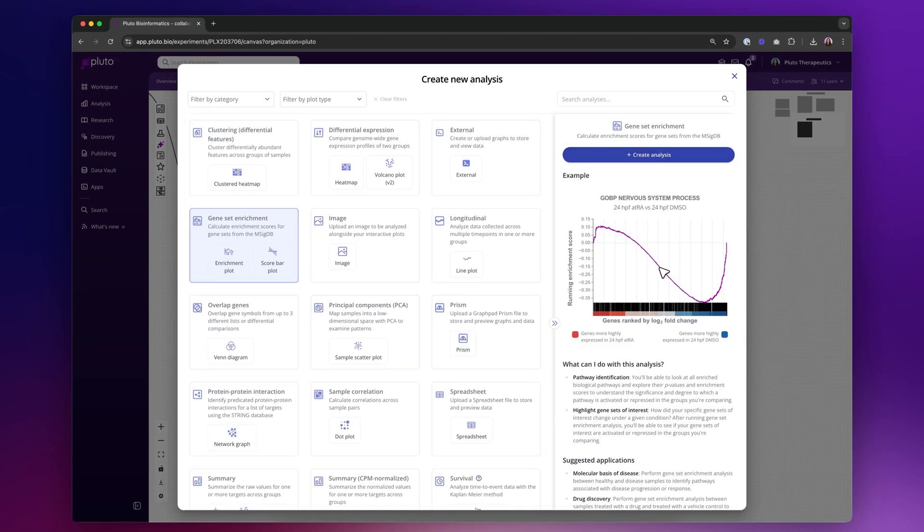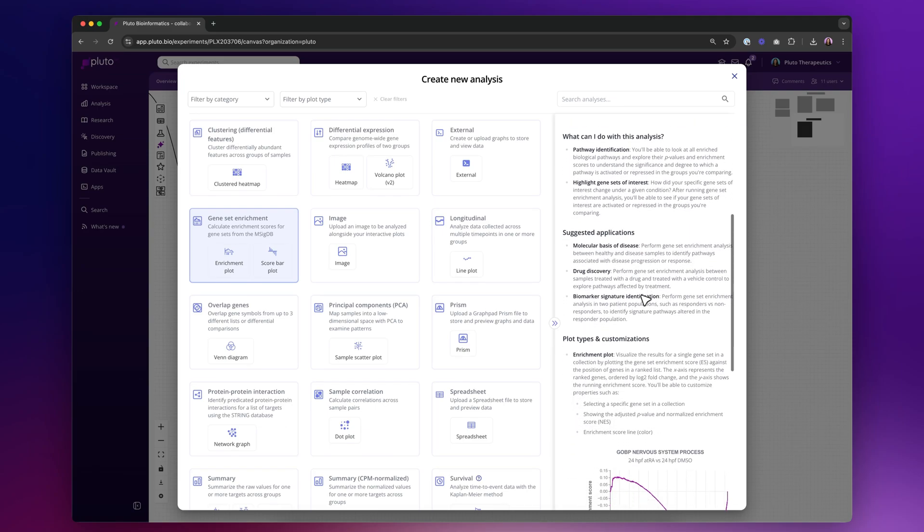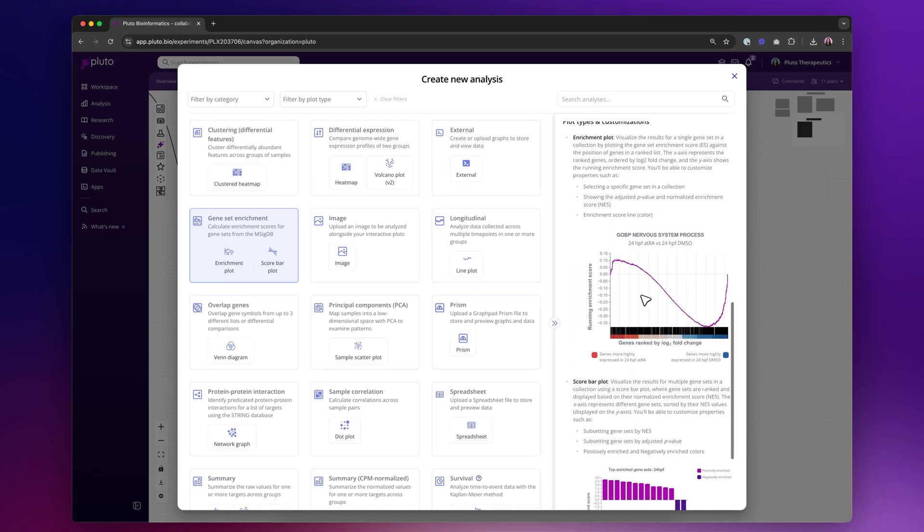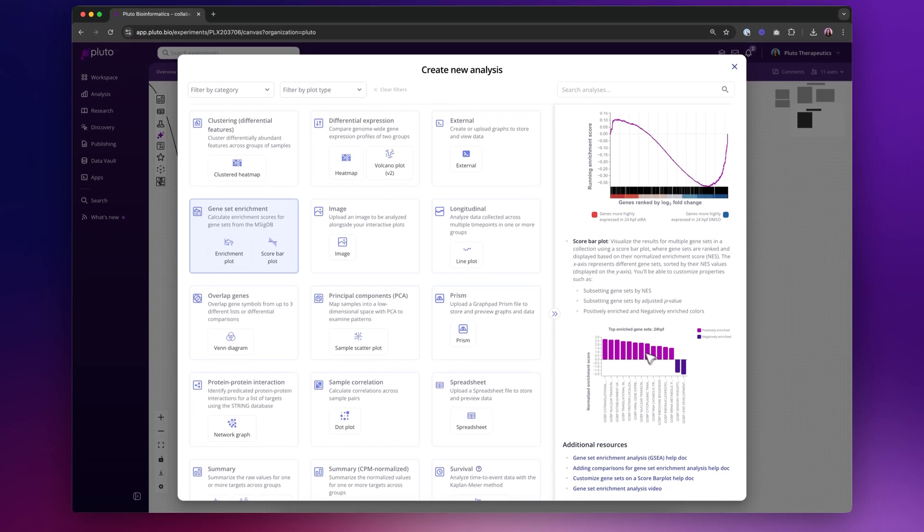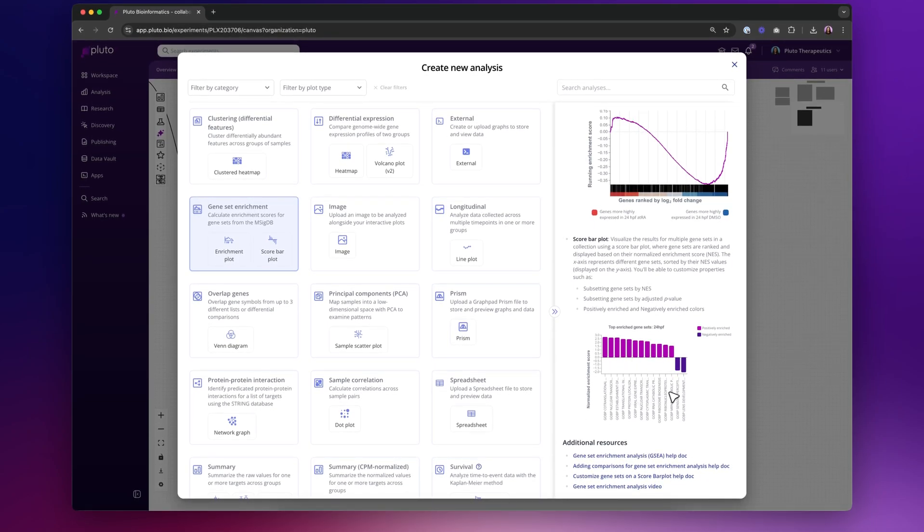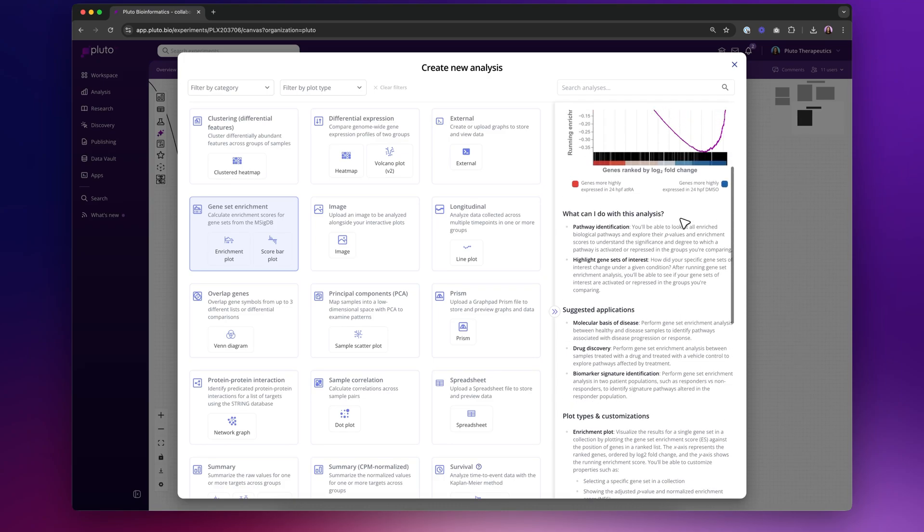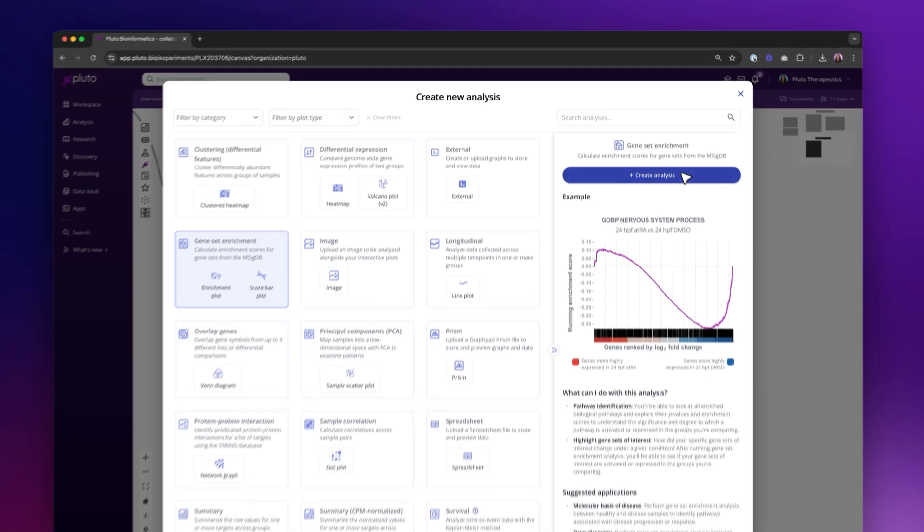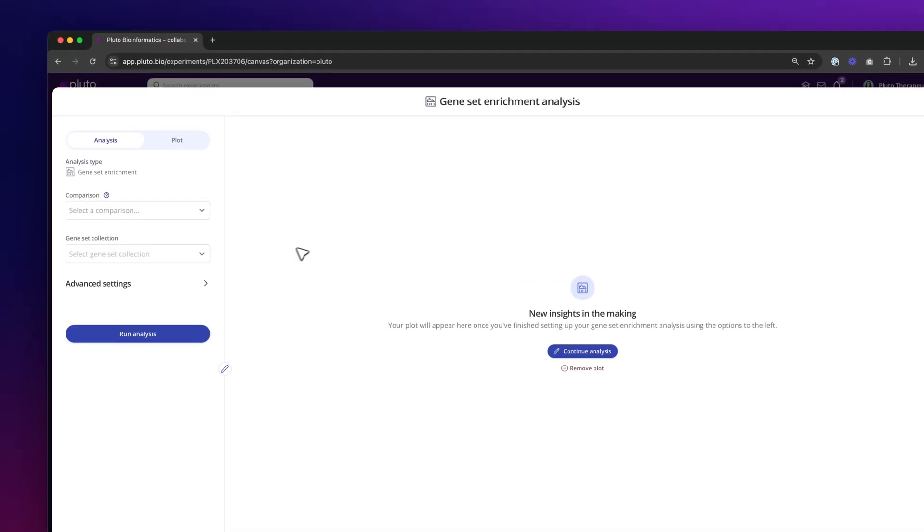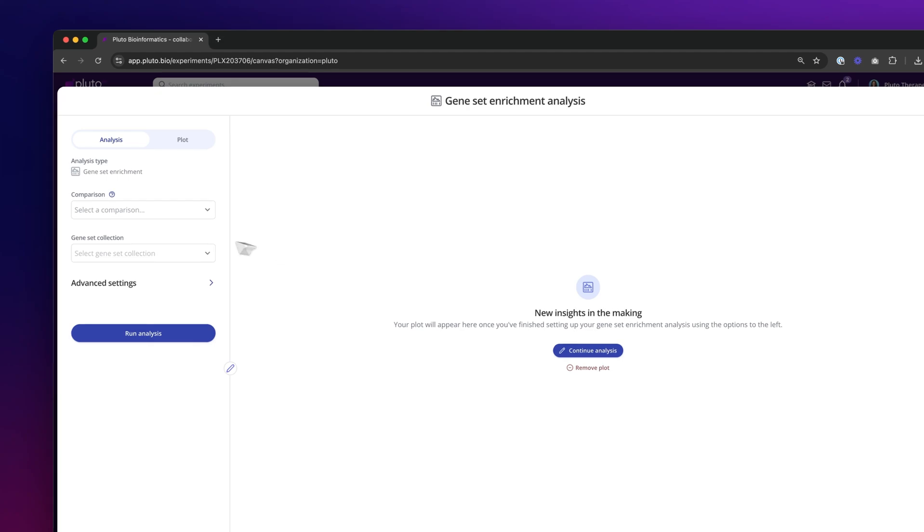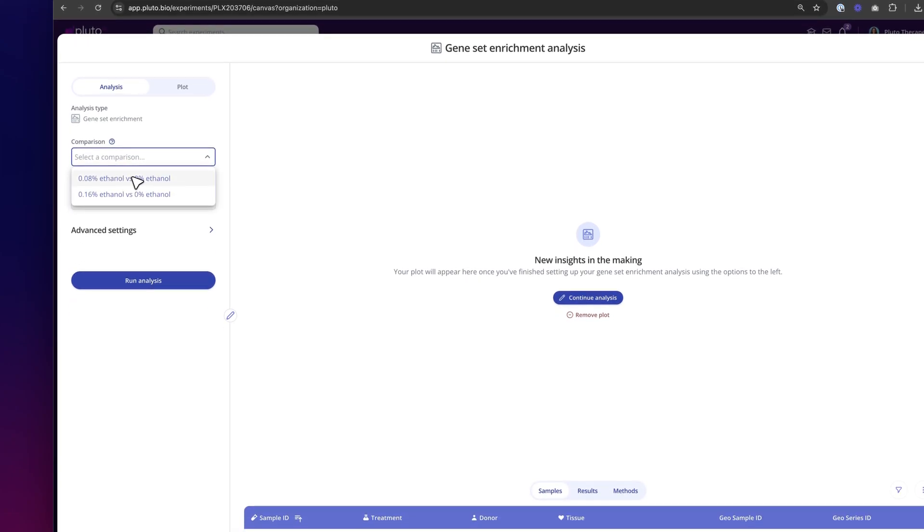And here you'll be able to see a preview of the kinds of visualizations you can use for this algorithm. So we'll be able to create this enrichment plot. And then if we scroll down past the suggested applications, you'll also see that you can create bar plots that show multiple pathways at once, as opposed to just a single gene set shown in this visualization. So we'll create this analysis. And the first thing that I need to select is which comparison from my differential expression analyses do I want to use as input for this pathway analysis. So I've already done pathway analysis on this lower. I'm going to do this higher version for the GSEA that we're running now.